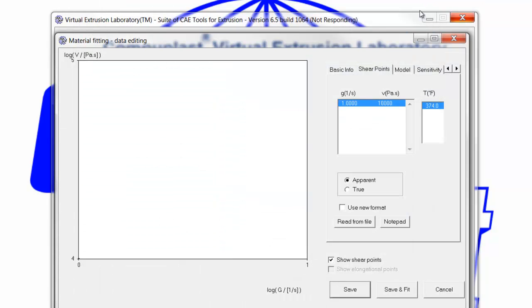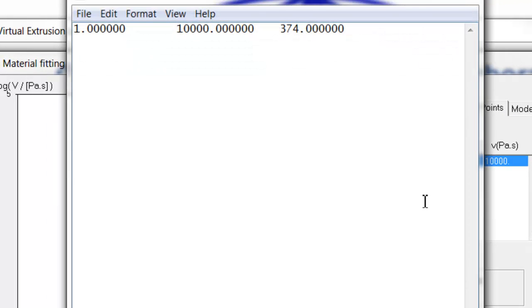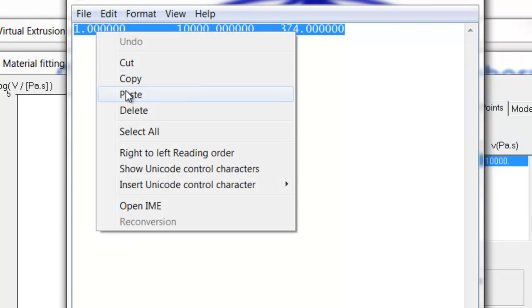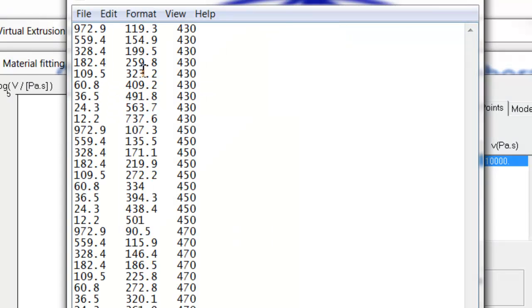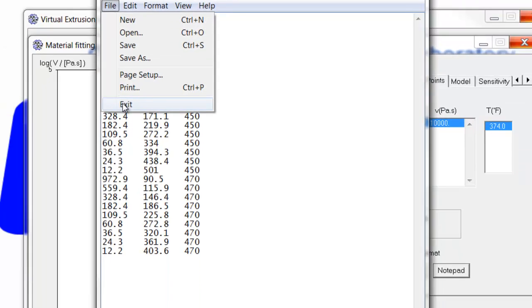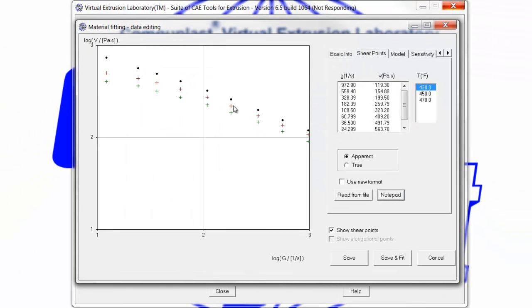We put the Excel file away, and go to Notepad, which shows the one default data point. We simply highlight that one data point, then right click and paste our data over top of it. Here we have now the data from our measurements. We simply save and exit, and our data now shows up in the graph and in the column at the three temperatures that we had measured.